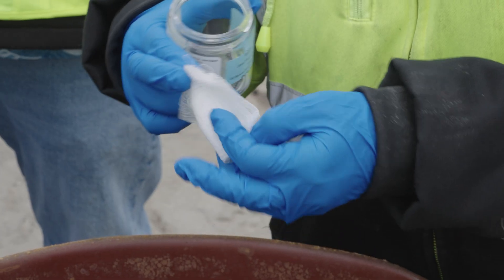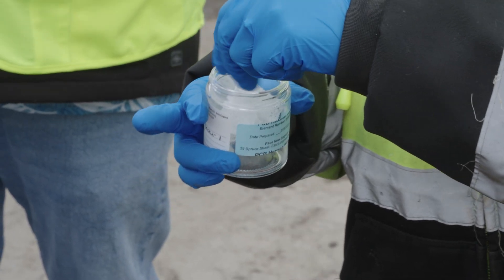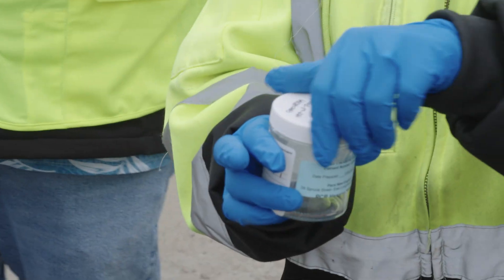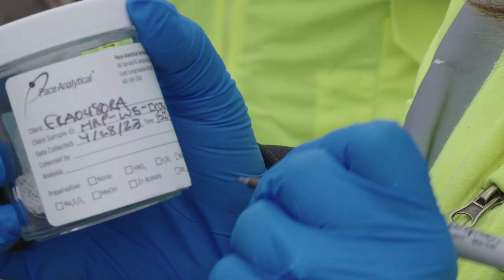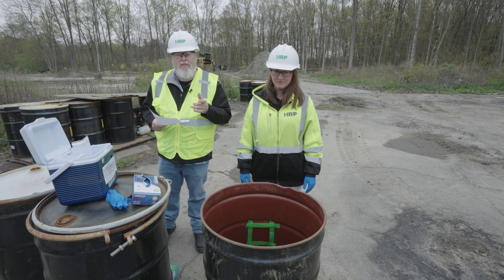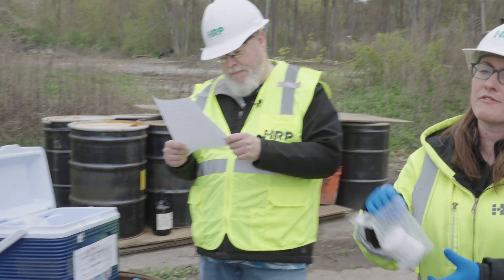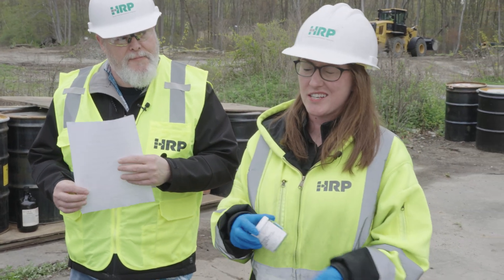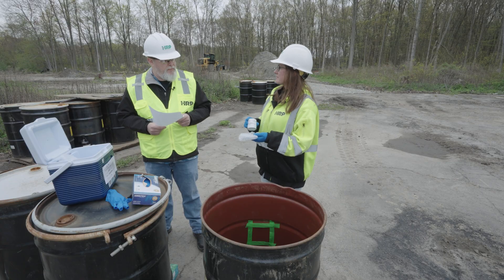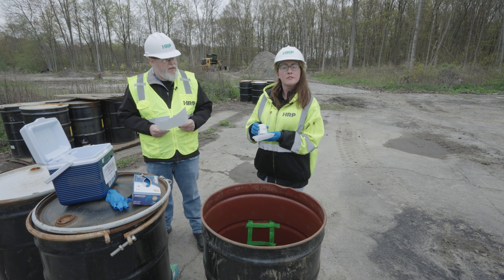When you're done, you're going to fold the wipe with the side you used facing in and place it in the supplied collection vial. Then you're going to cap the vial and label the sample. Next, you're going to prepare a field blank to confirm that there is no cross-contamination with your sampling and within the lab. Since the wipe is pre-moistened, all you have to do is label the jar.